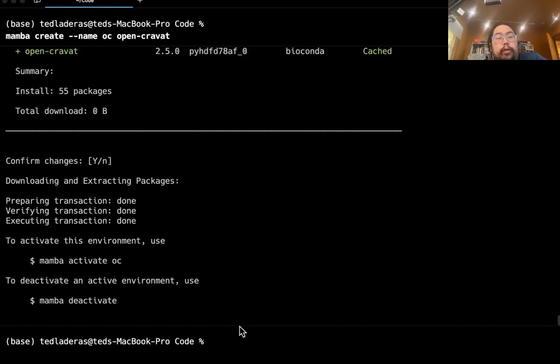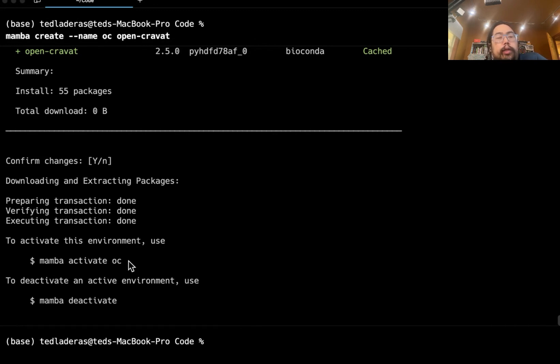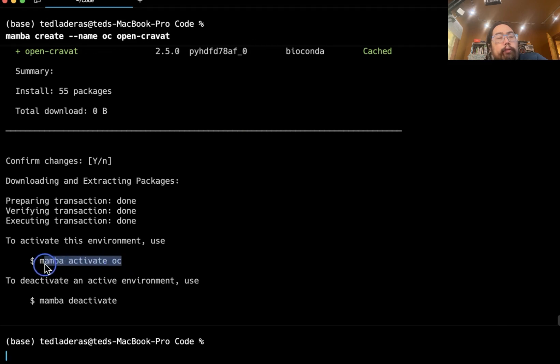Okay, so now we've installed open cravat. And you can see that we've got this little message here. So when we want to activate open cravat in the conda environment, we're going to use this command.